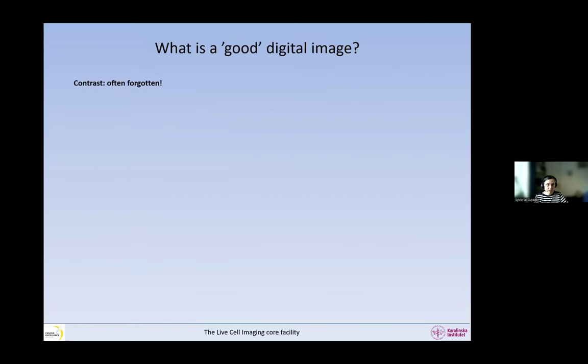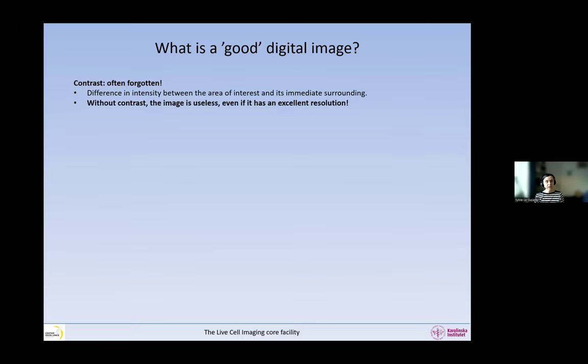But then we have sampling and contrast. So unfortunately, contrast is often forgotten. It's a very important part of building an image that allows us to answer our scientific question. So what is contrast? It is the difference in intensity between the area of interest and its immediate surrounding. So without contrast, the image is useless, even if it has an excellent resolution. We'll have to think about it. And now I'm going to show this to you.